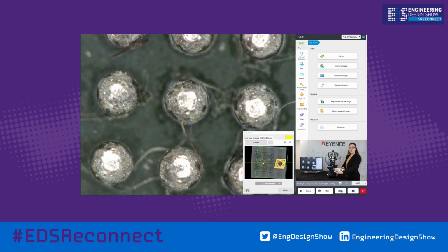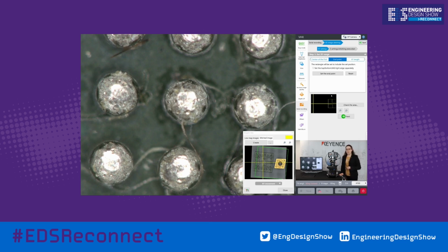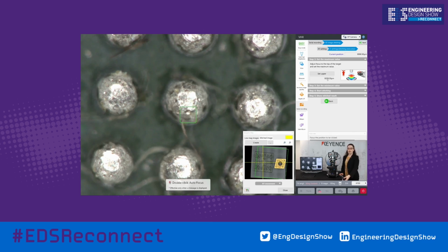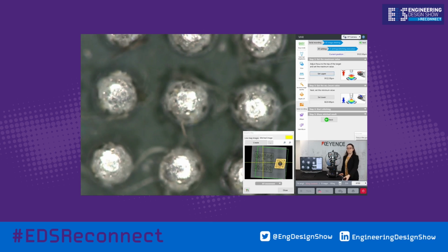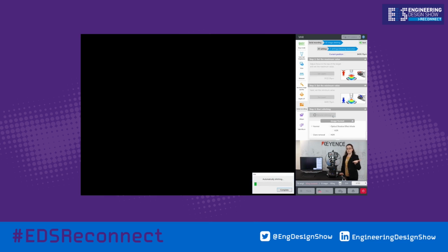All I need to do is press the image stitch button on the console. That takes us to our menu. We've got the option to choose between either 2D or 3D image stitching. We're going to go for 3D, obviously. Now I've already set up our area here. All I need to do is click Next, set our upper and lower limits for that image stacking, so that the system knows exactly where we want to be stitching, and I just press Start.